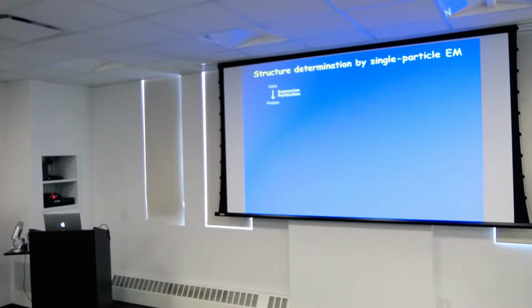You want to express and purify your protein. And so there are a bunch of different problems that can occur. What used to be a really big problem is sample heterogeneity, because the software, the image quality was much worse. So data processing was much more difficult.